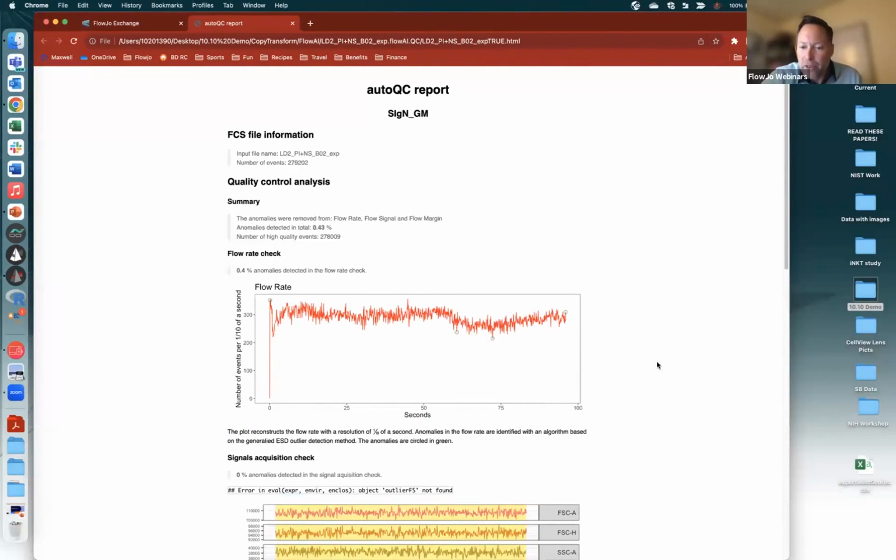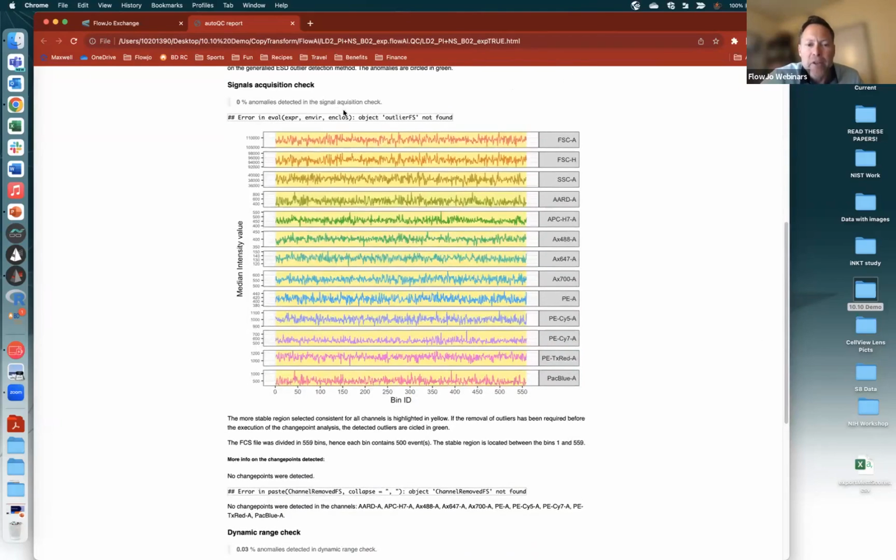And it produced those by first looking at the flow rate, saying, okay, there's this spike at the beginning, startup. Put a green circle on that. Say that 1/10 of a second's unreliable. Sure. Rest of it's pretty good, drops down a little, rises up a little. So it takes out a few moments here and there where the flow rate looks a little sketchy. Here is the signal. Everywhere it's yellow, it kept. So in this data file, it kept basically everything.